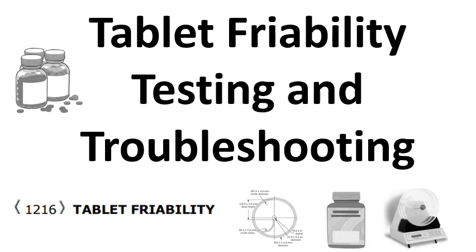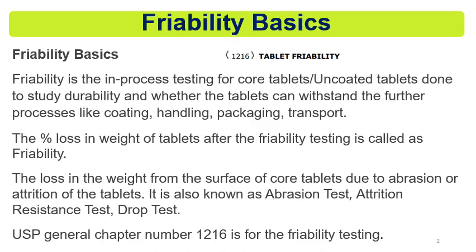and the friable tablets may undergo chipping and breaking during the film coating and during the transport. So friability testing becomes important, and in this video we will understand the friability testing basics, its criteria, how the test is performed, and what are the ways for troubleshooting the friability problems. So let's start with the video.